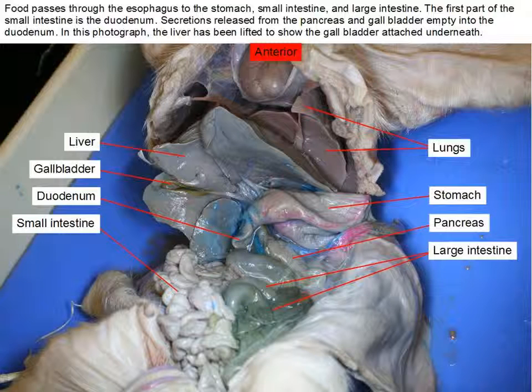Actually, I should highlight this for you. So, one of those famous write-this-down kind of things. You need to know the sphincters. Where are each of the valves? What are they good for? What chamber do they allow the progression toward? So this is the first of many things where we'll ask you to trace the path of X through this system. So this will be trace the path of food through your pig from the mouth to the colon.